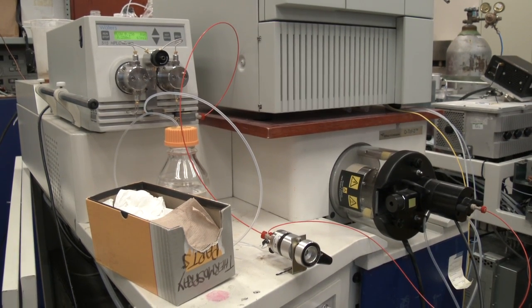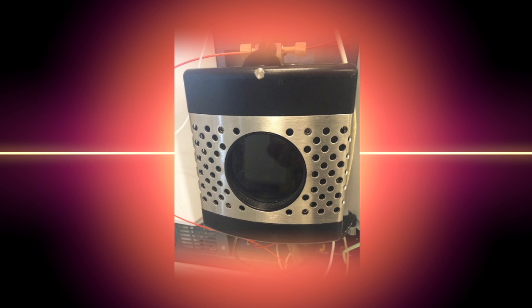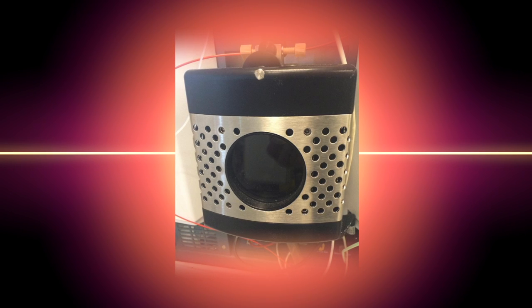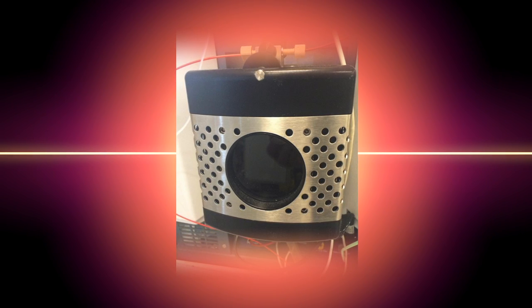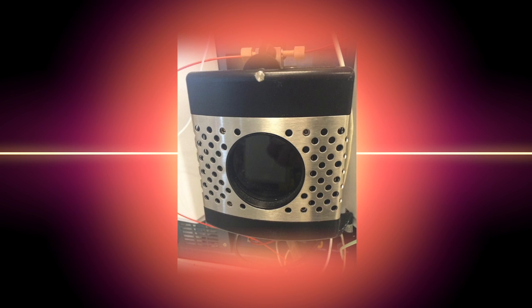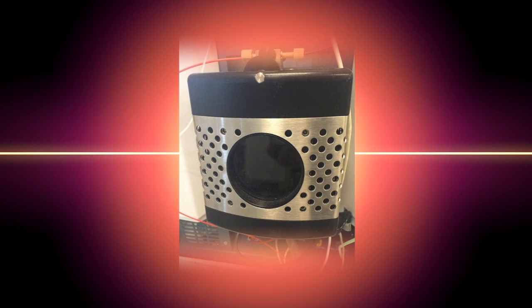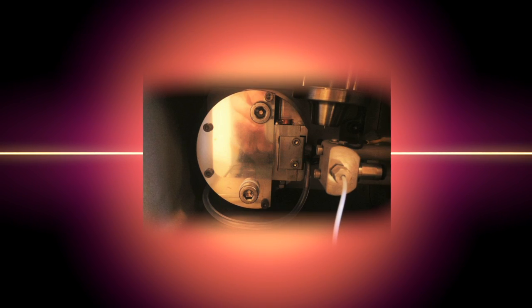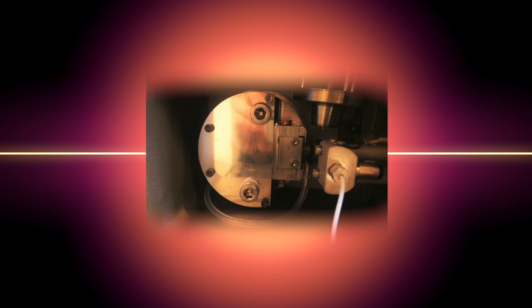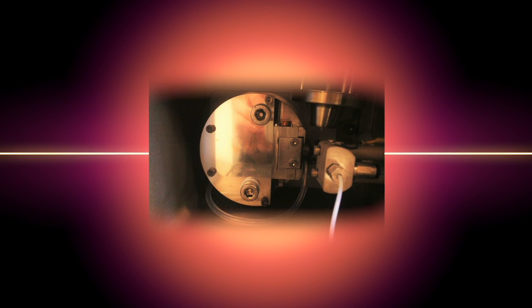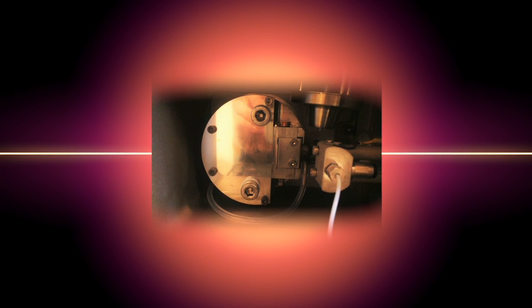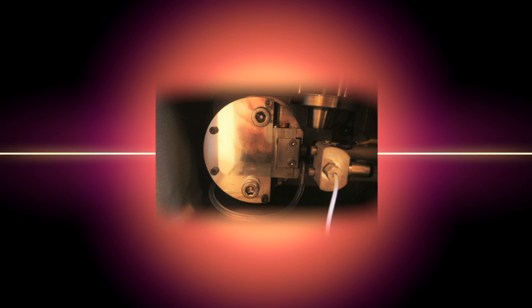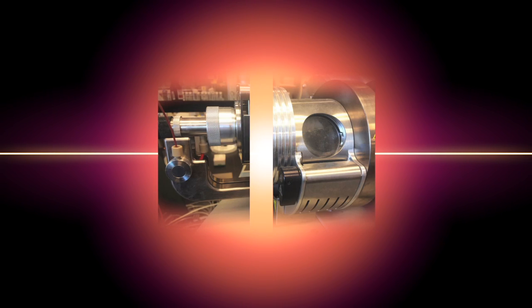The positioning of a quadrupole before the time-of-flight mass spectrometer or a triple quad allows a single molecular ion to be selected and then fragmented as in an MS/MS experiment. This provides information on fragment ions and that can be used to identify individual molecules, similar to the fragmentation patterns used to identify electron impact ions.